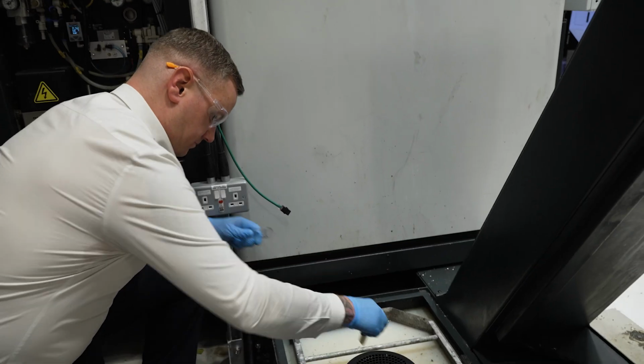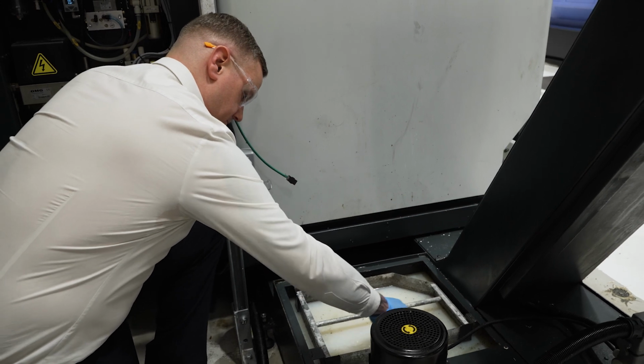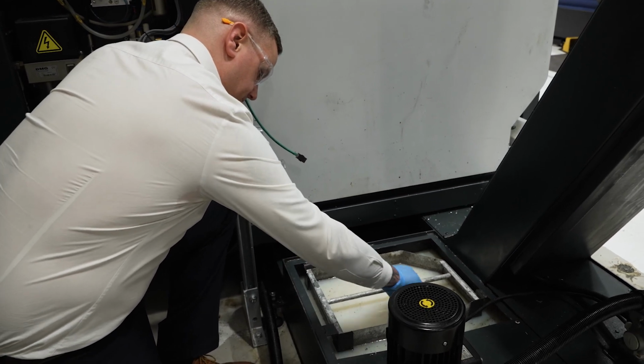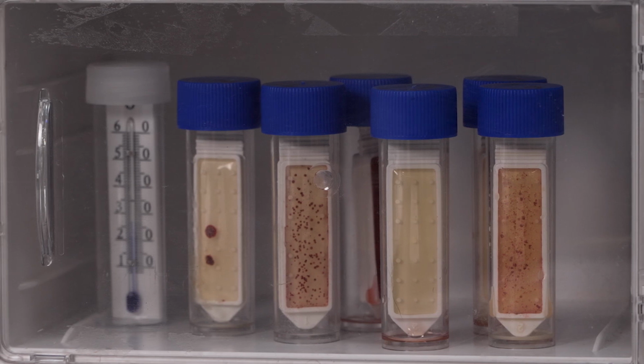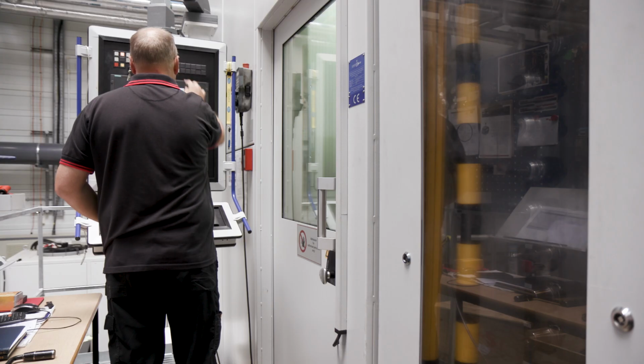So, Daryl, how often should you be testing with a dipslide? Metalworking fluid dipslide checks should be undertaken weekly. It's up to you to act quickly when dipslide tests show a change in the growth of bacteria in your metalworking fluid. If you do this, you'll help to maintain the quality of the fluid, the working environment, and to protect the health of workers and to reduce operating costs.